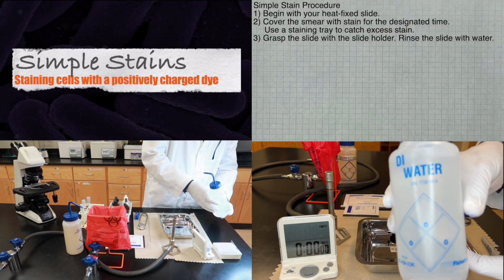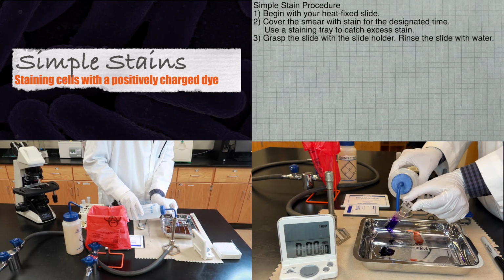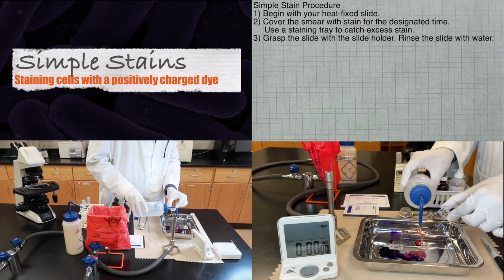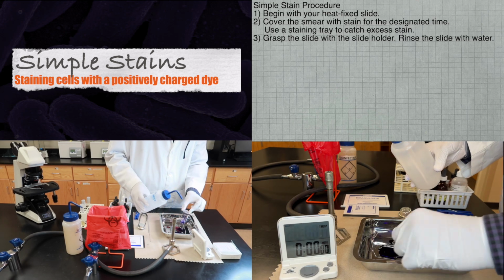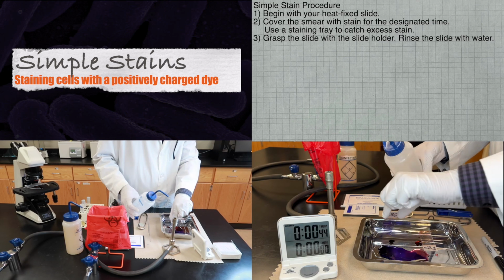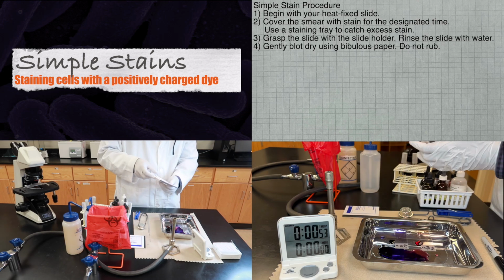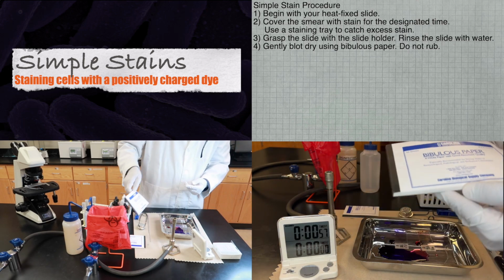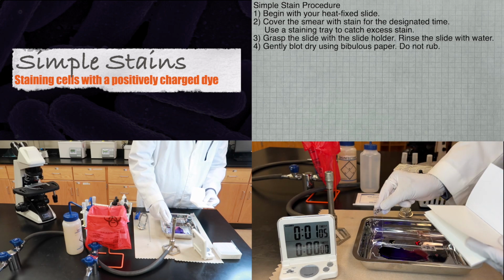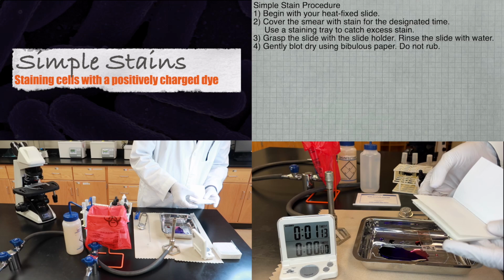Next, please take the slide and thoroughly rinse the slide with water. Next, please gently blot dry your slides using bibulous paper. Ensure that you are gently blotting and not rubbing the slides with the bibulous paper.